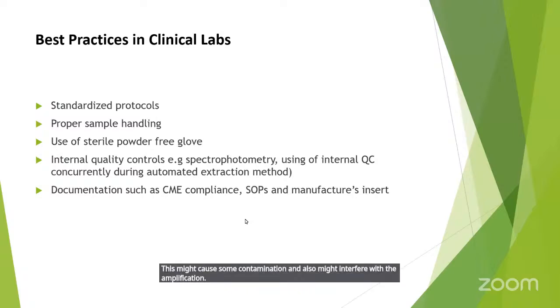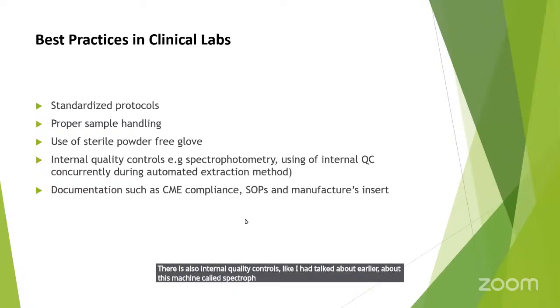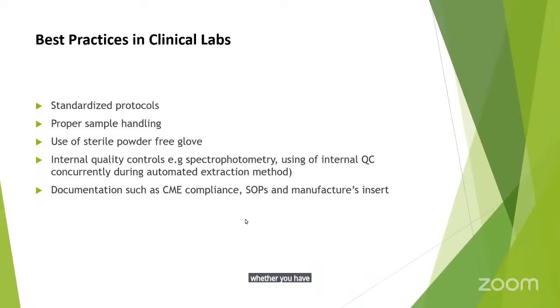There are also internal quality controls, like I talked about earlier, with the spectrophotometer, which is normally used to check the quality of your DNA.